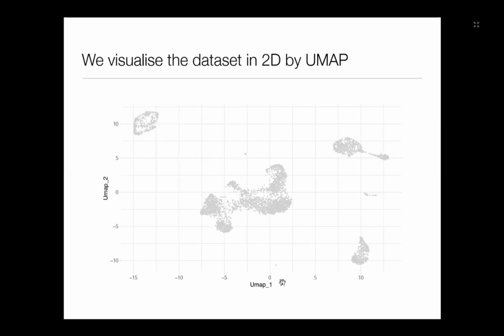Remember, the cells, PBMC, sequenced with 10x and SMART-seq. And we see some, let's say, clouds in the UMAP space. Again, every dot is a cell. UMAP helps us to find different groups of cells and also transitions between these groups. Well, not in this case, but you can have that.